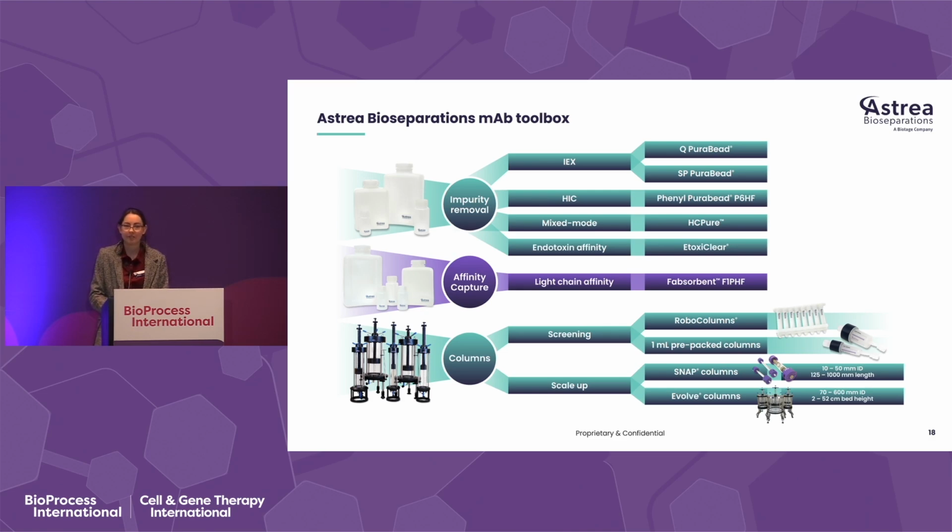We've got a couple back here. Thank you. It was a very great presentation. I had a question on the surrogates you use as a substitute for MVM and XMLV. Has there been a direct comparison with the actual live viruses? Are they comparable?